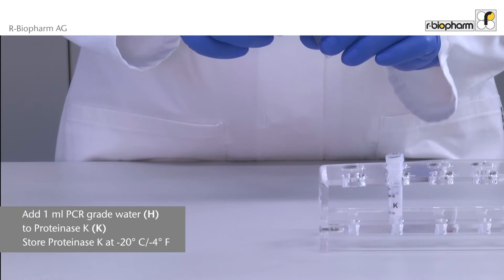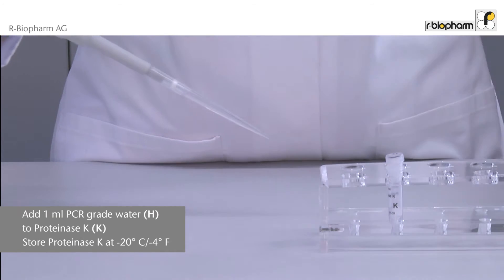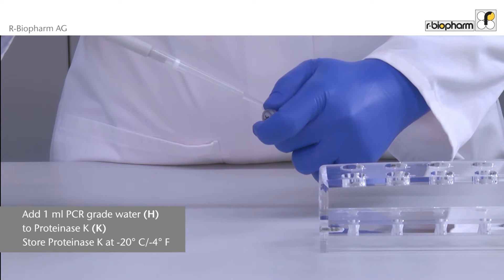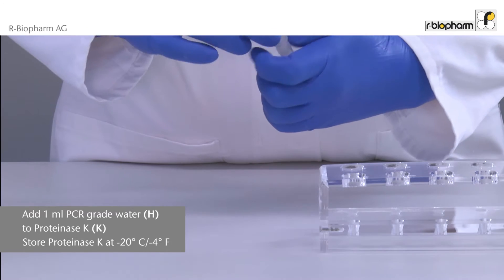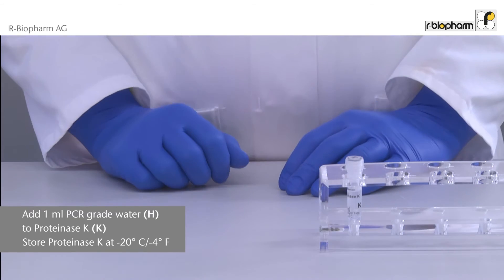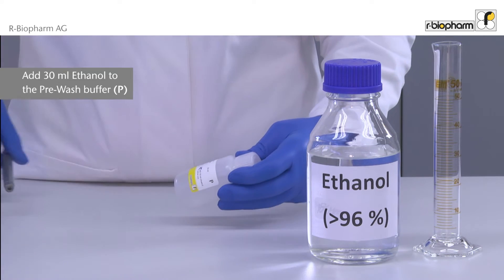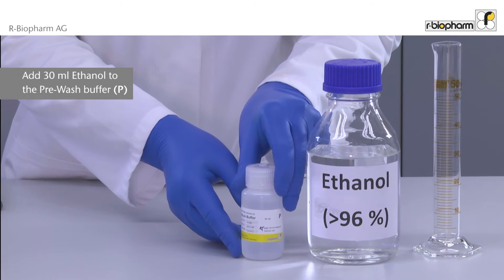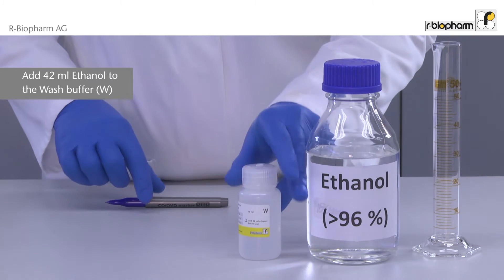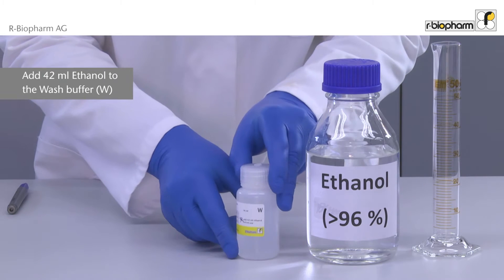If the Prep Advanced kit is used for the first time, the reagents have to be prepared. The letter coding of the bottles facilitates handling. Start with adding one milliliter of PCR-grade water to Proteinase K. Then add 30 milliliters ethanol to the pre-wash buffer and mark the bottle. Lastly, add 42 milliliters ethanol to the wash buffer. All reagents are now ready to use.